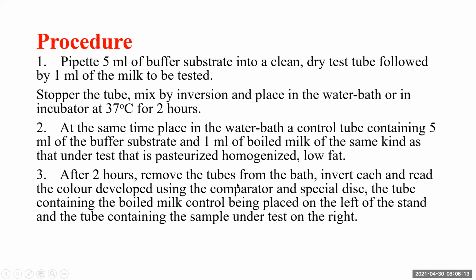After 2 hours, you remove the test tubes from the incubator or water bath, invert, and then read the color using the comparator and a special disc. The tube containing boiled milk may show you just white color, and the tube which contains the sample milk, which is inadequately pasteurized or contaminated with raw milk, will show development of yellow color like this.